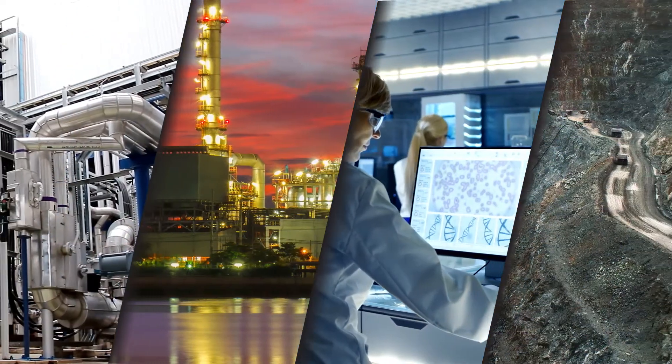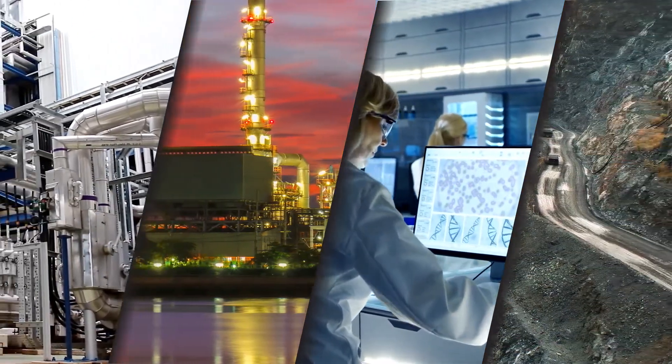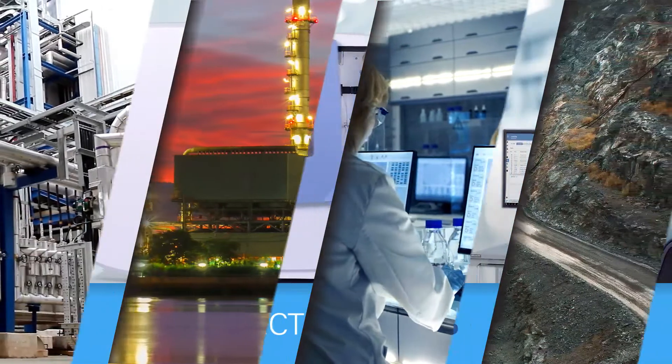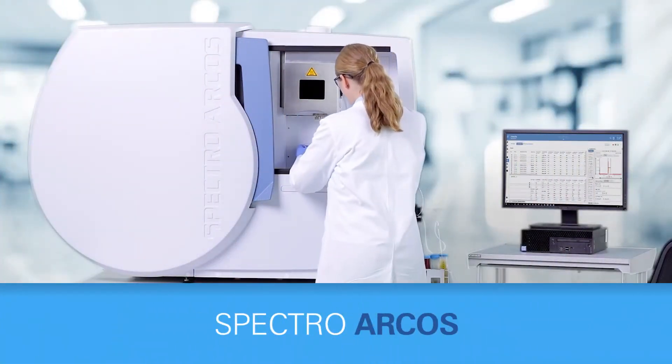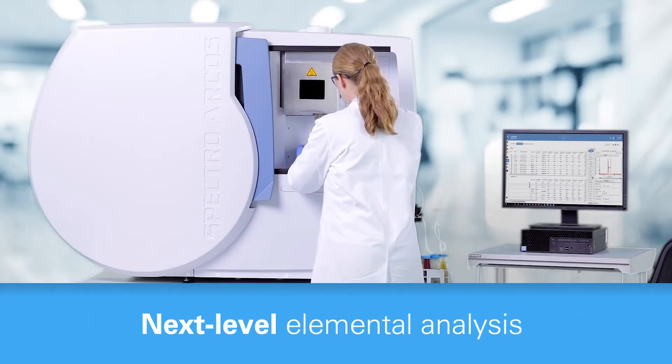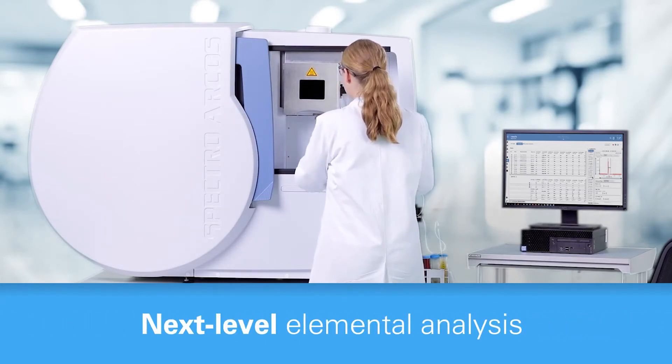For years, experienced users in industry and research have preferred SpectroArcos. They know it's the ideal ICP-OES instrument for their most demanding analyses. Today, its newest generation takes SpectroArcos to the next level.